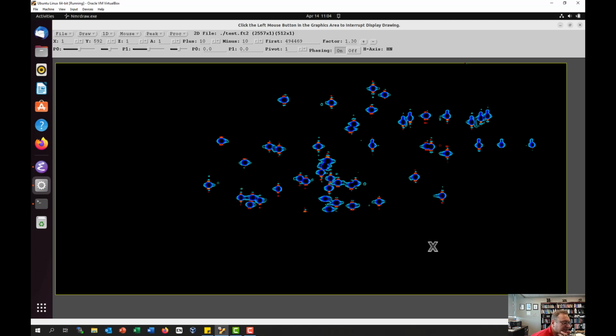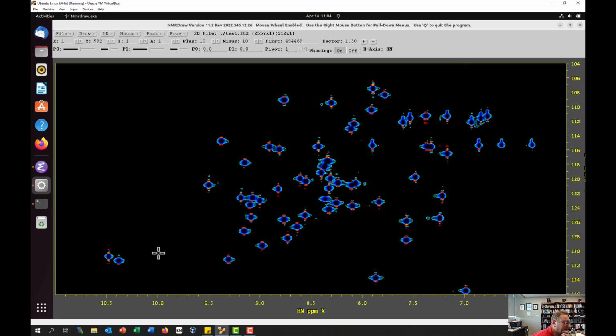And so you're seeing flecks of little bits of noise here and there. You're also seeing some truncation artifacts. So we've truncated the oscillations pretty early, and so you see a little bit of sinc wiggles on the left and right. That's all that is. Don't worry about that.